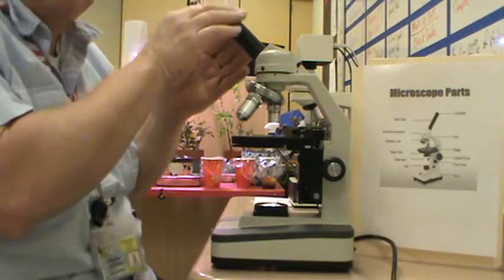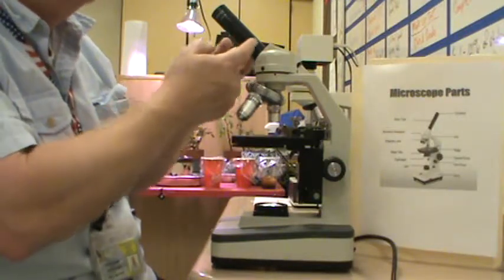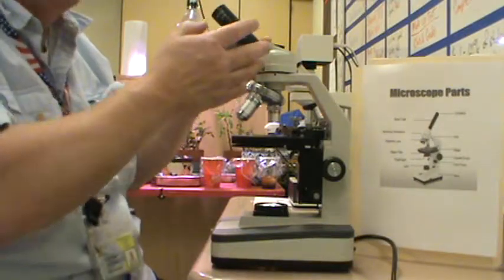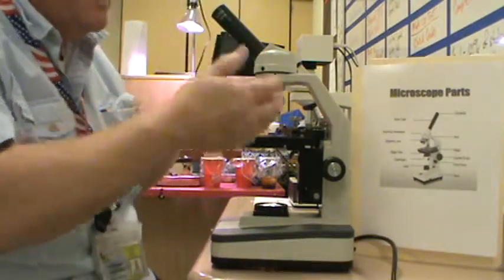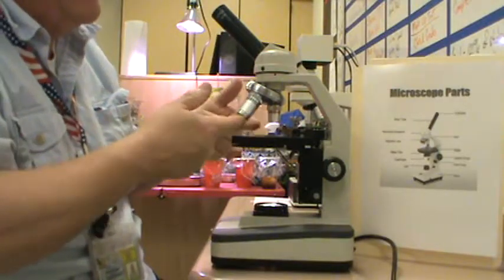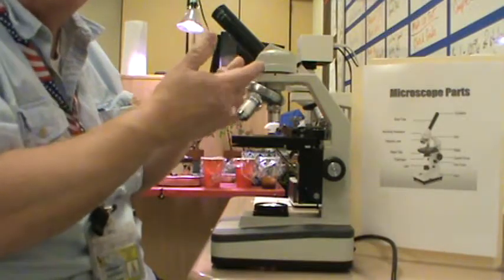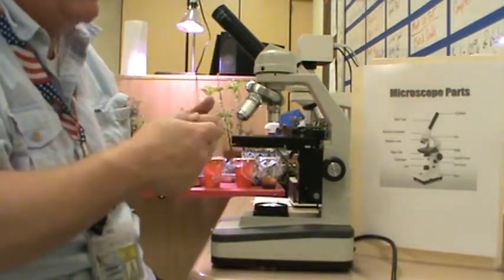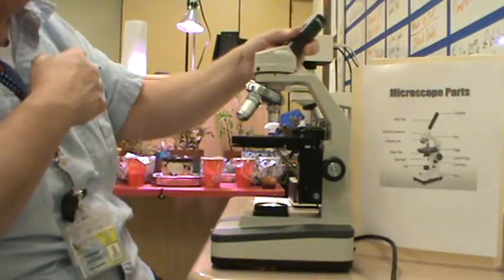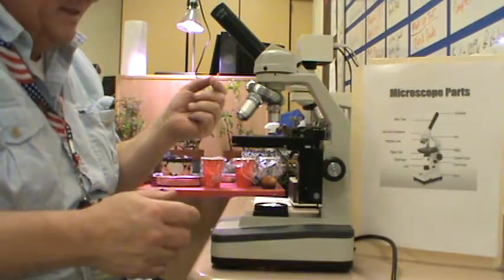This is the part that you look through to see what it is you're looking at. This is the body tube. This body tube's purpose is to, besides make it more comfortable for you to see what you're looking at, also, this lens and these lenses need to be a certain distance apart. So this body tube's purpose is to provide that distance. In our particular microscopes, these eyepieces can rotate in order to make it more comfortable for you or others to see.